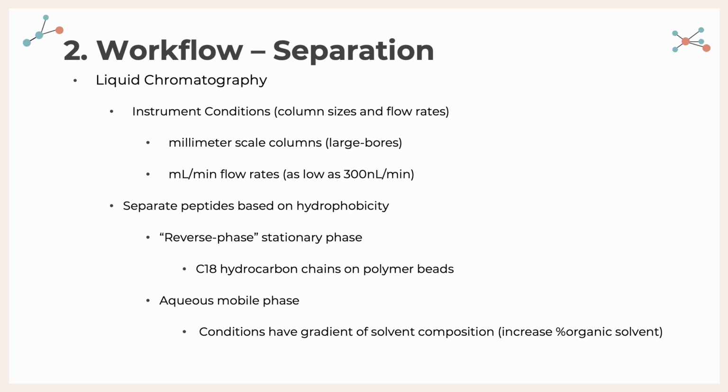It really is just basic liquid chromatography. If you have no idea what I'm talking about, I would recommend a small little Google search. It is pretty simple. You're essentially just separating your analyte into small parts and then picking out which of the parts is the one that you want. That's basically what chromatography is.